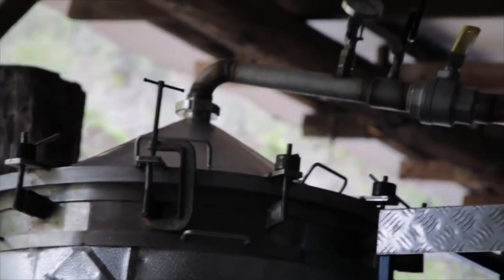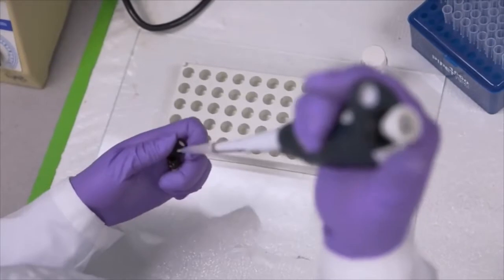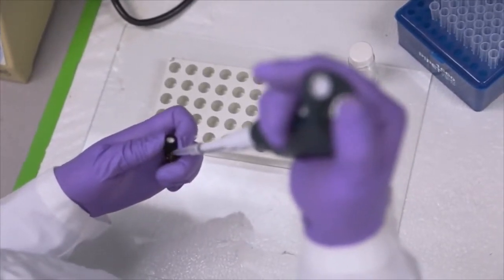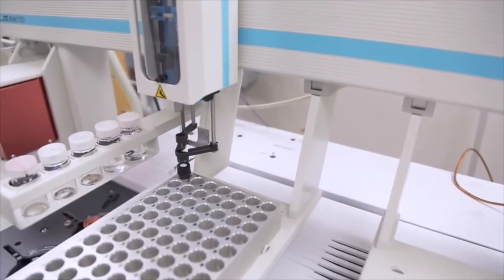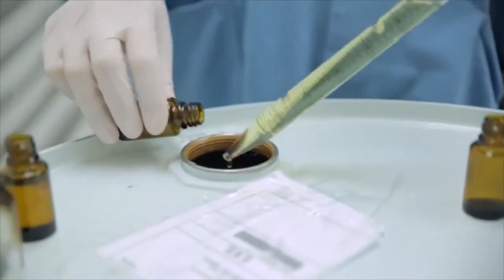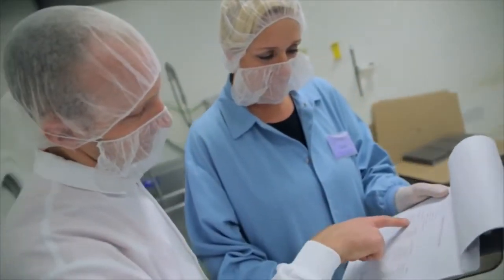Steam distillation is a process used to collect essential oils. GCMS is a quality control test that reveals which constituents are present in an essential oil and at what amounts. This is important information for determining if the potency and purity of an essential oil meets quality control standards.